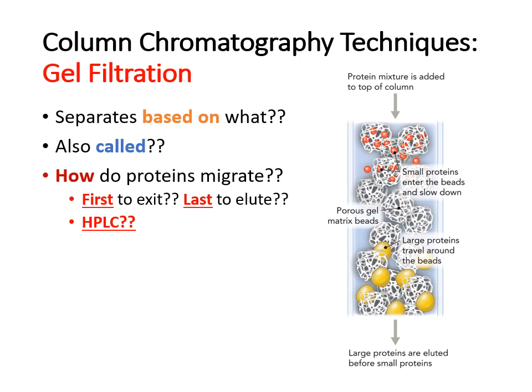Now, when we're talking about protein techniques, I also want to show you column chromatography techniques. There are a few different examples for this. There are even more than we're going to go through in this lecture that you'll see in some of your other classes. The first one I want to point out is gel filtration chromatography.